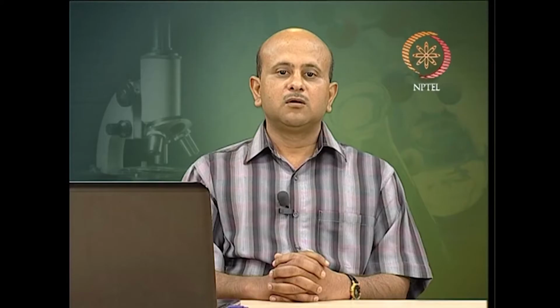Now, let us start with microscopy and let us discuss some of the terms which are related to microscopy. The first term we are going to discuss is absorption. I think everybody understands absorption. When the light passes through any object, the intensity is reduced depending upon the color absorbed, and thus the selective absorption of white light produces a colored light. So, any time light passes through a certain object or specimen, certain absorption takes place which reduces the intensity of the transmitted light.